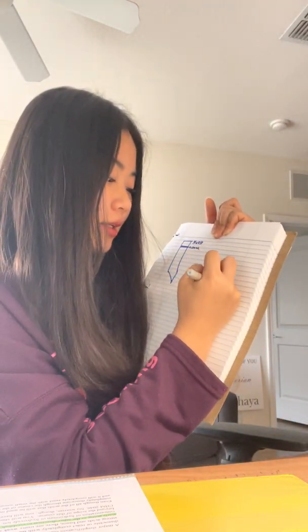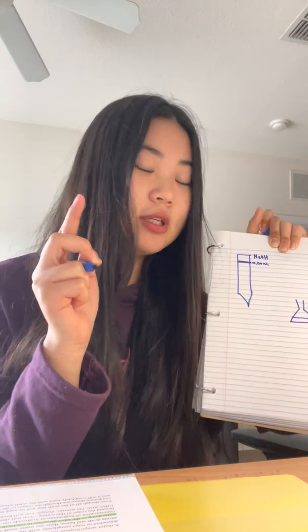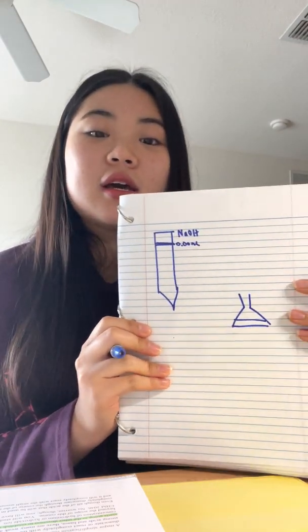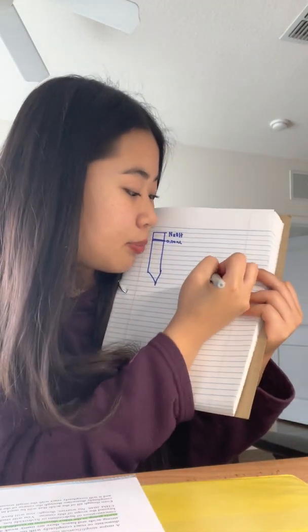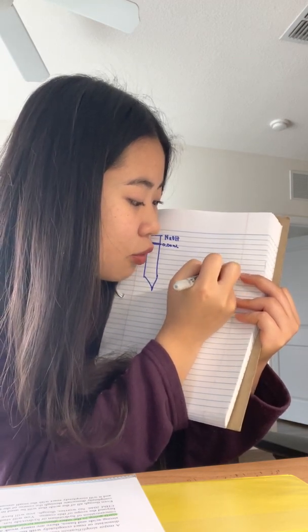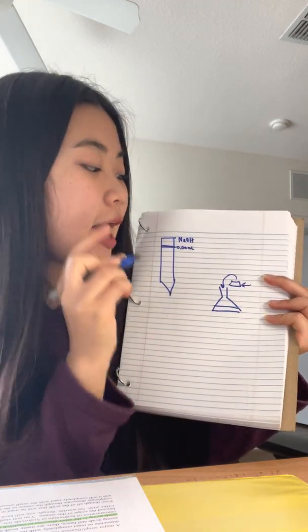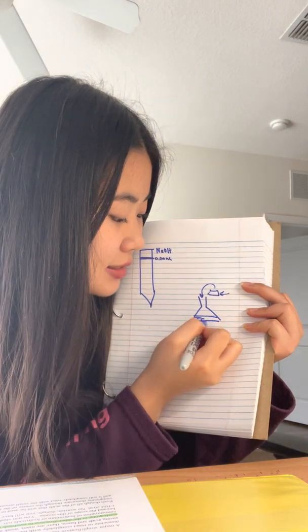To prepare the acid, you need to get a flask. Measure your acid — they're going to tell you how much acid you need. Use a weighing boat, weigh the weighing boat first to tare it, then put the correct amount of acid into the weighing boat and weigh that. After you get that, go back to your workstation and transfer the acid into the flask using deionized water. Pour water into the boat and wash it so that every single thing gets into the flask.